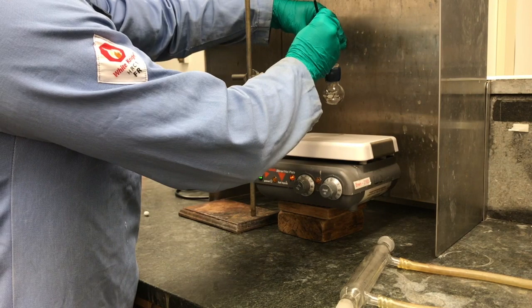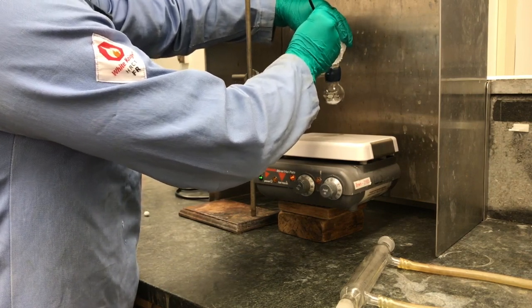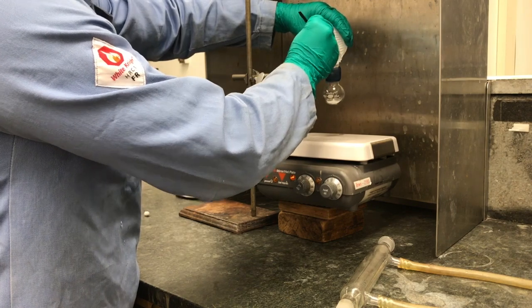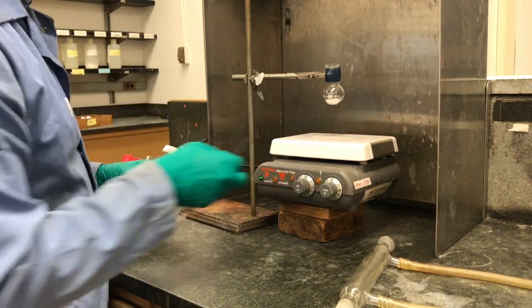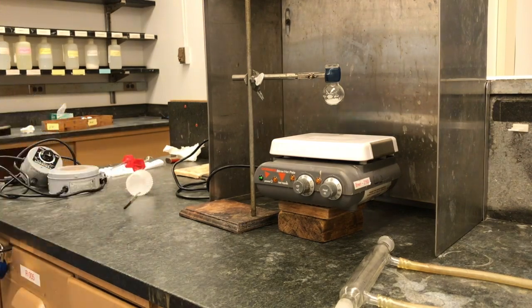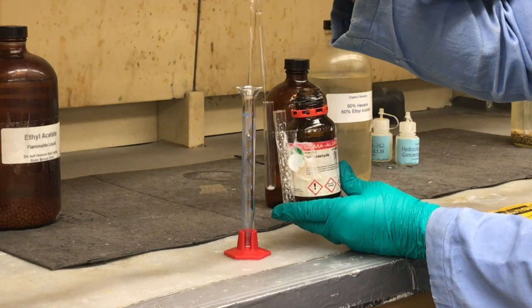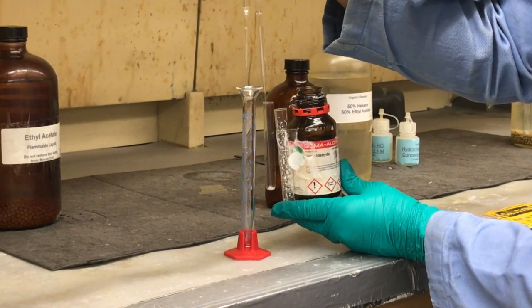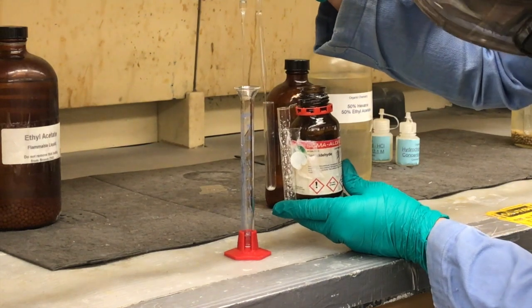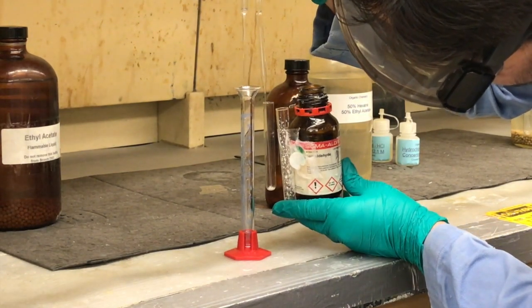So now that we weighed out our urea, we're just going to add it to this 25 milliliter round bottom flask, and then also put a little stir bar. Here you can see we're measuring out benzaldehyde. We want 1.3 milliliters, and we're going to add this 1.3 milliliters of benzaldehyde to our reaction flask.